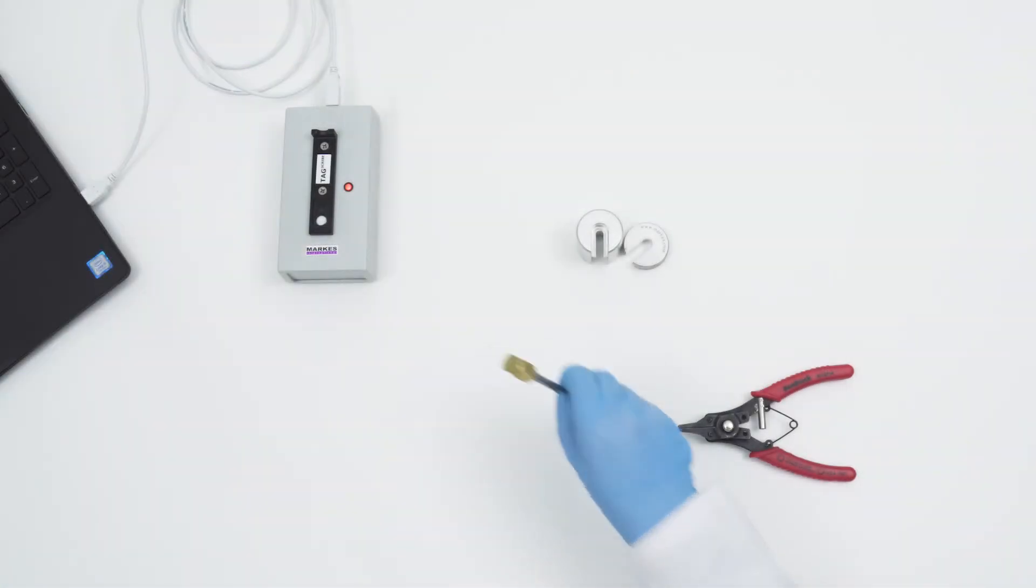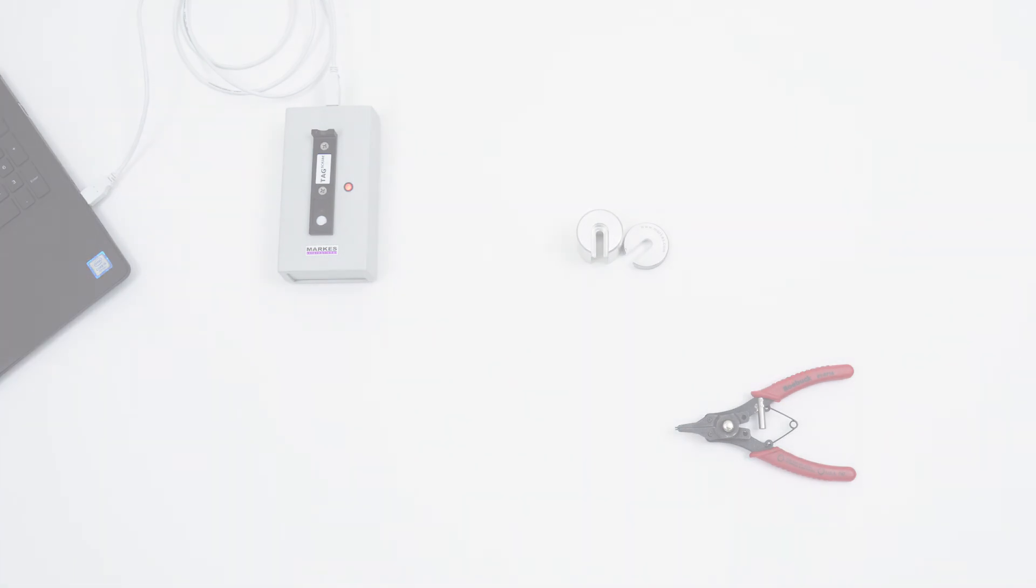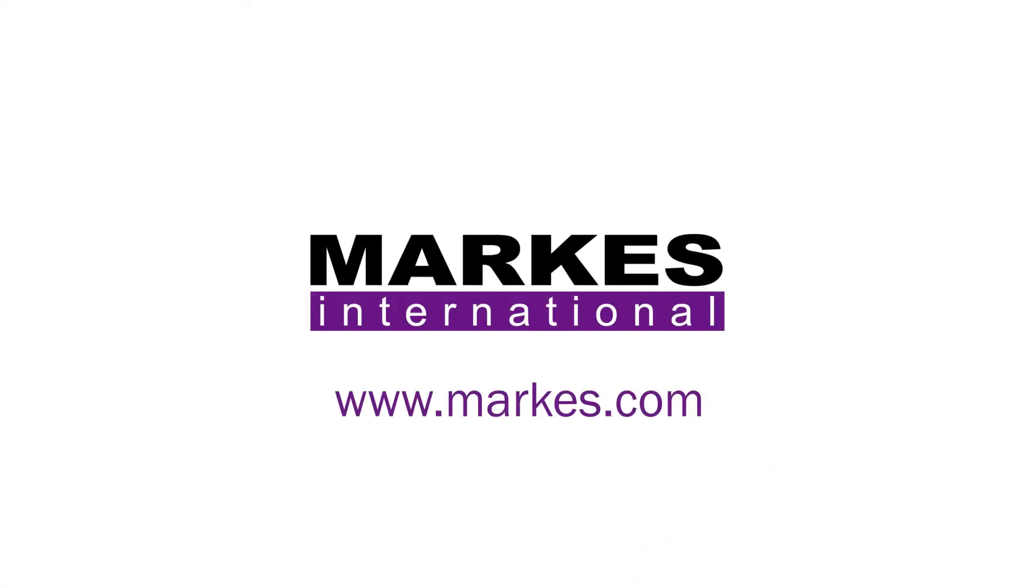Your tube is now ready for sampling. For more information, visit markes.com.